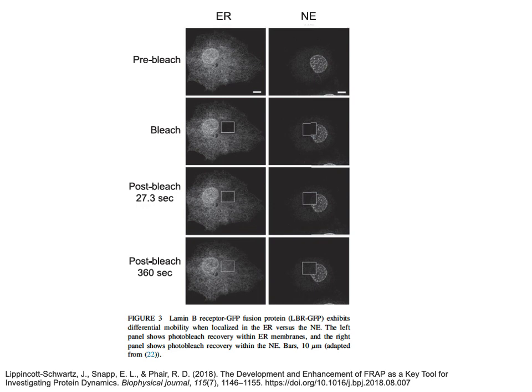So one of the last little pieces I just want to talk about is the equipment that's needed for FRAP. Usually a confocal microscope is going to be used. That confocal microscope is going to be hooked up to a computer system with software that does a lot of this imaging for you. Yes, you look through the microscope to set up your focal plane and get things into focus, but then a lot of the manipulation is happening through a computer.